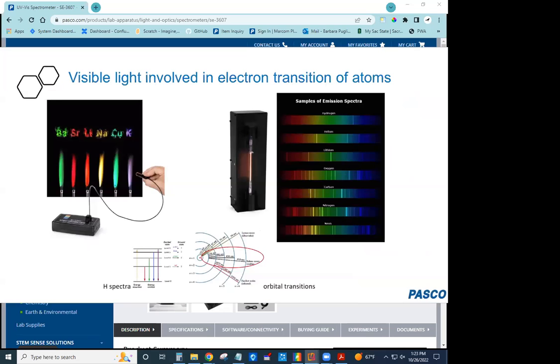It's very similar in terms of the process, and the UV is good for organic molecules, particularly molecules that are white, that don't show what their substance is. If you look at copper, it's always blue, for instance, and those metals that you would use in flame tests, that's from electron transitions around an atom, as you see in the bottom of this picture.